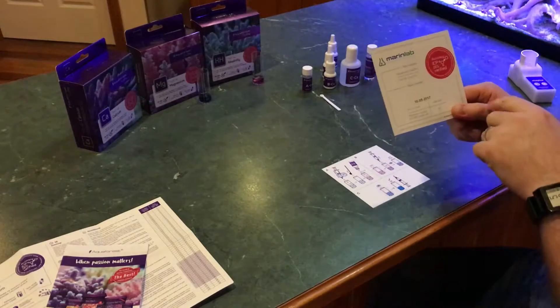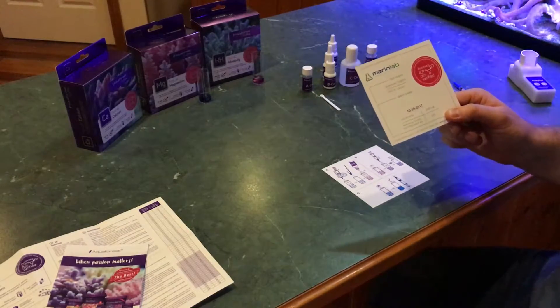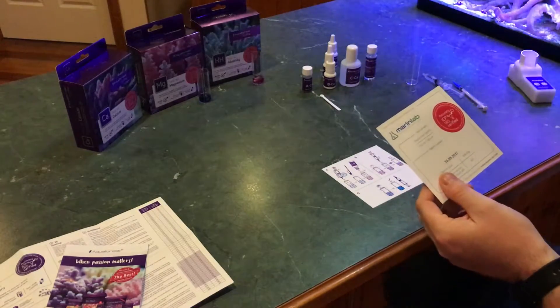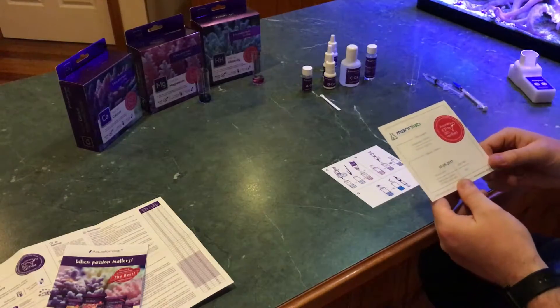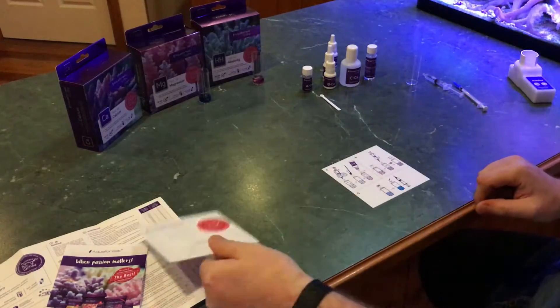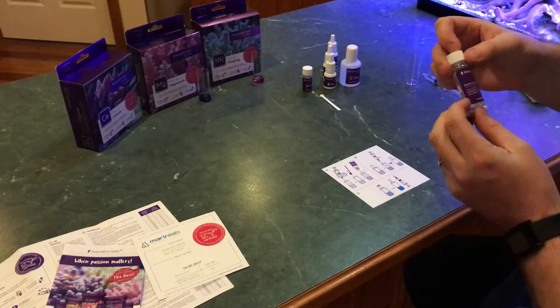Maybe a good preview to have a look at. ICP verification — this one's pretty much on the knocker. The test kit with the reference solution came in at 420 to 430, ICP tested 425, so honestly I think you're going to get much more accurate than that. I probably should test the reference solution at some stage and verify that, but it's impressive.